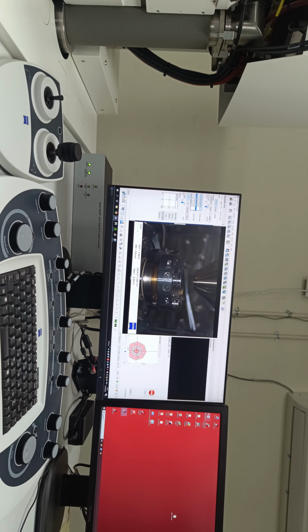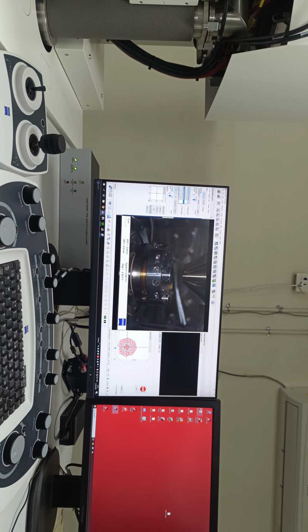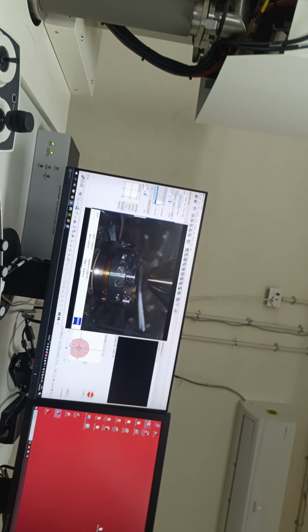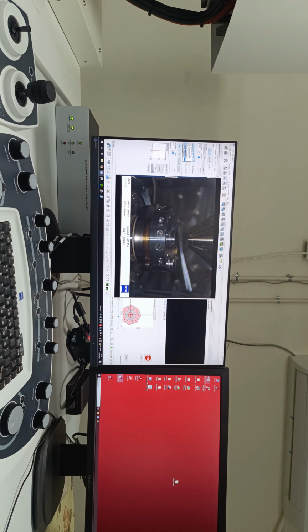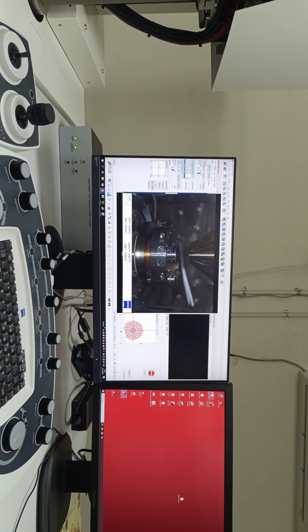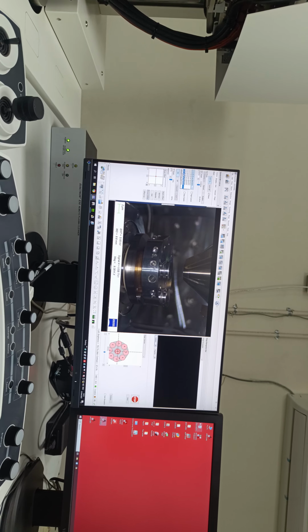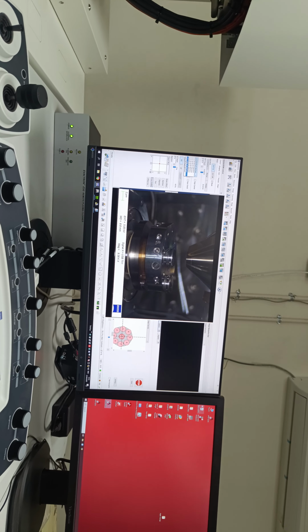So 30 is the ideal. You can go below that. Preferably, other than EDS and EBSD, we cannot go beyond 30. For EDS and EBSD, sometimes we can choose the 60. Did you choose any other aperture for your EBSD application, or do you still use 30? 60. So see here, for EBSD and EDS you need a large amount of signals, so you need to use a bigger aperture. A large number of electrons should flow and hit your sample. So that is the idea of the aperture.